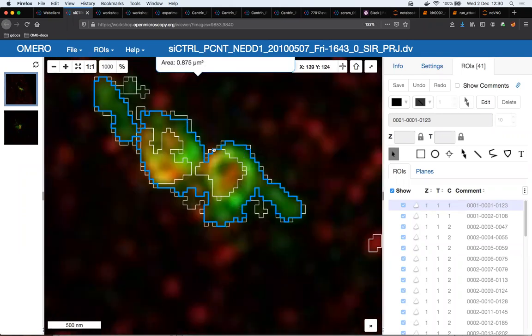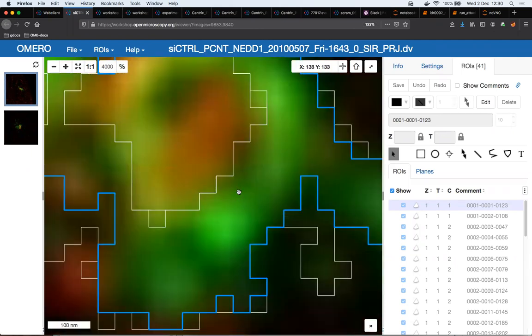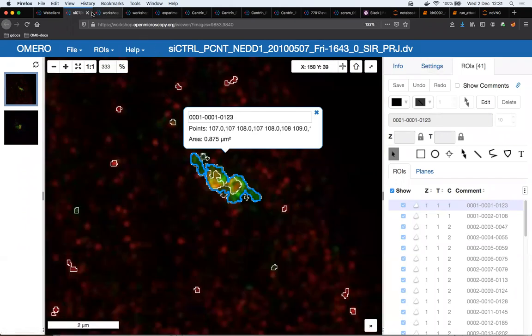This would be 1 centriole, this would be another centriole. Instead, it's a huge region of interest of the shape of a big sausage, and has 2 unwished-for whiskers here, and it encompasses both of the centrioles. So this didn't go well for this image for Fiji, and I can discard this ROI from my evaluation.